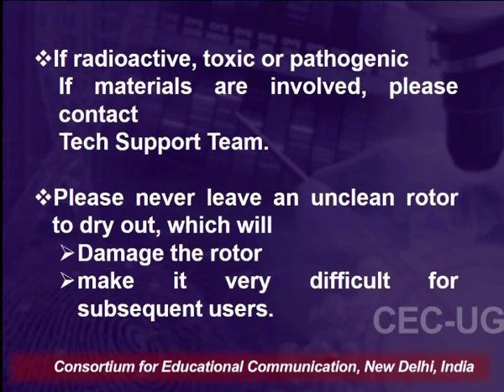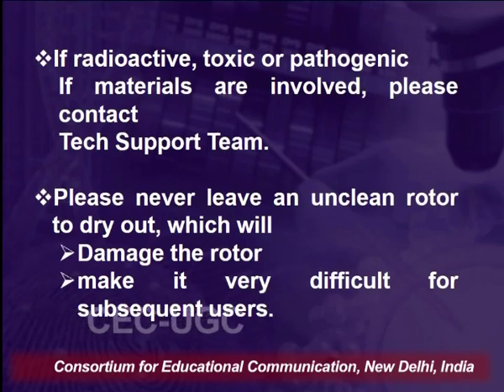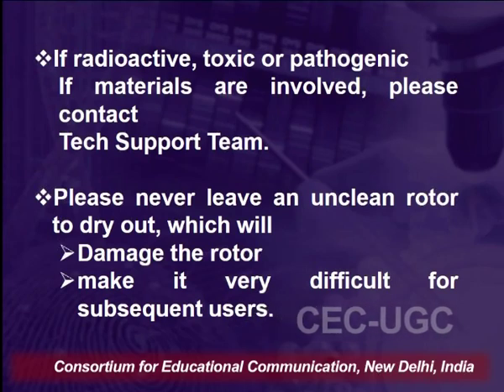A logbook should always be maintained with the centrifuge, and the rotors should be properly cleaned after use. They should be washed, and a cleaning kit should be used for any radioactive materials if present. Never leave an unclean rotor to dry out, which will damage the rotor. We should sterilize it with 70% ethanol. We should always open the centrifuge door and install the rotor. We should always properly follow the manual given by the centrifuge manufacturer, and we should carefully read the operating manual before following it.